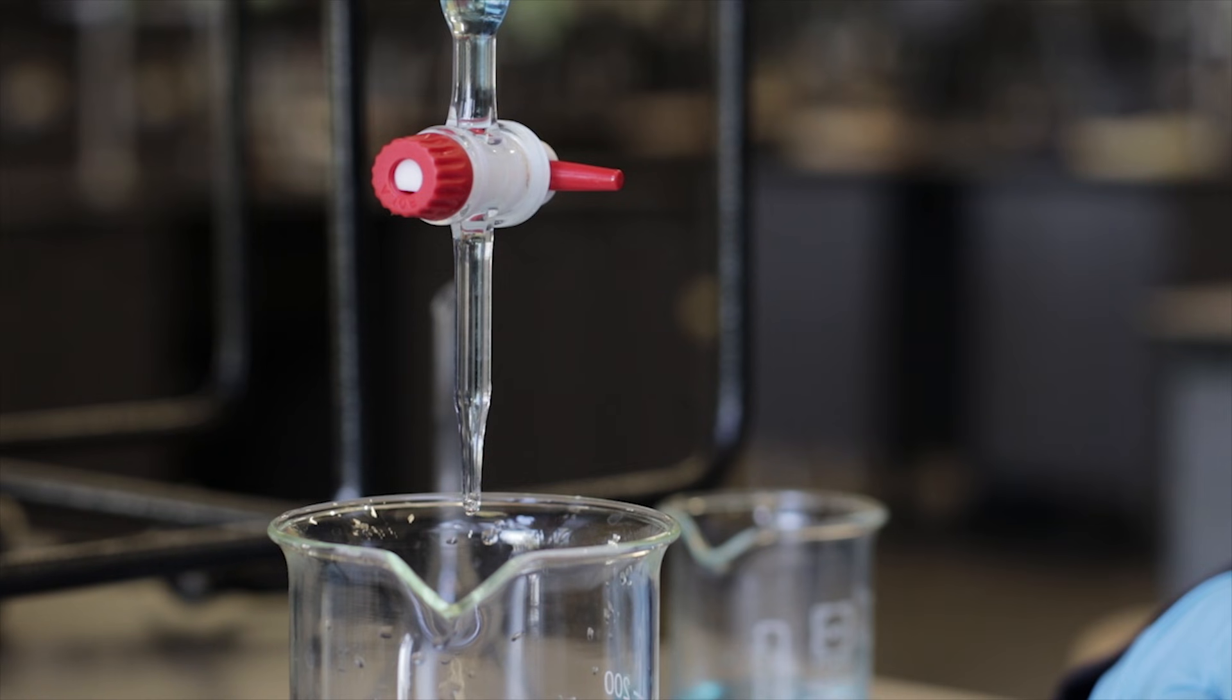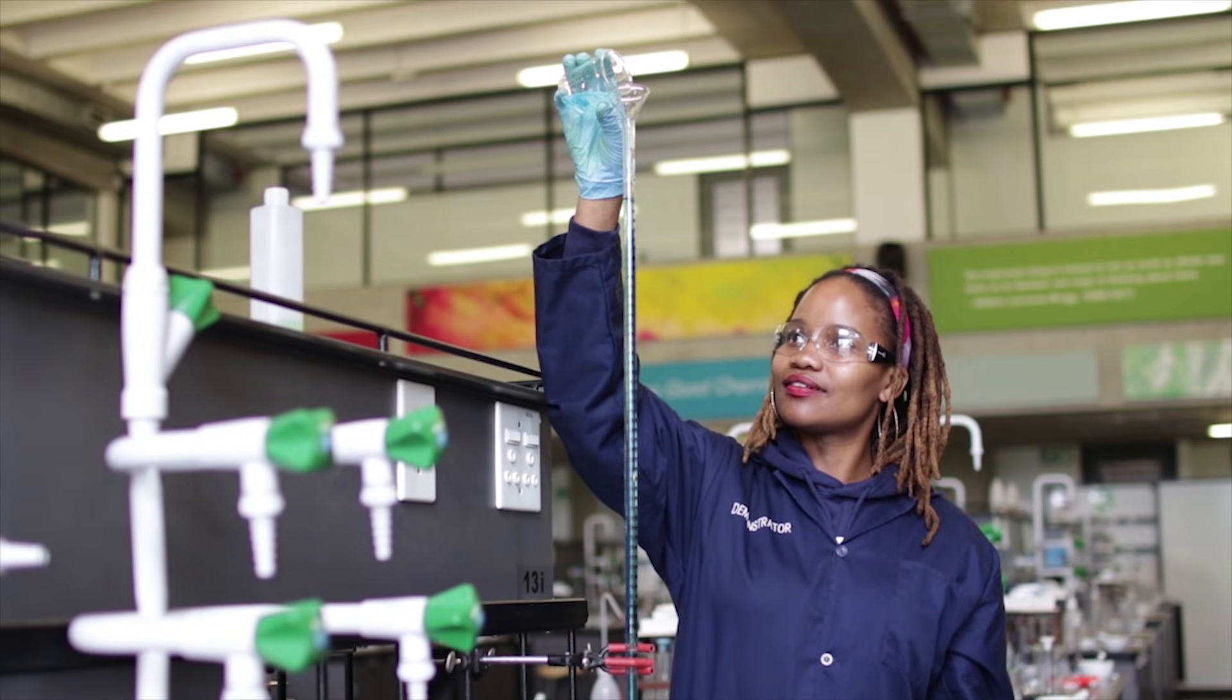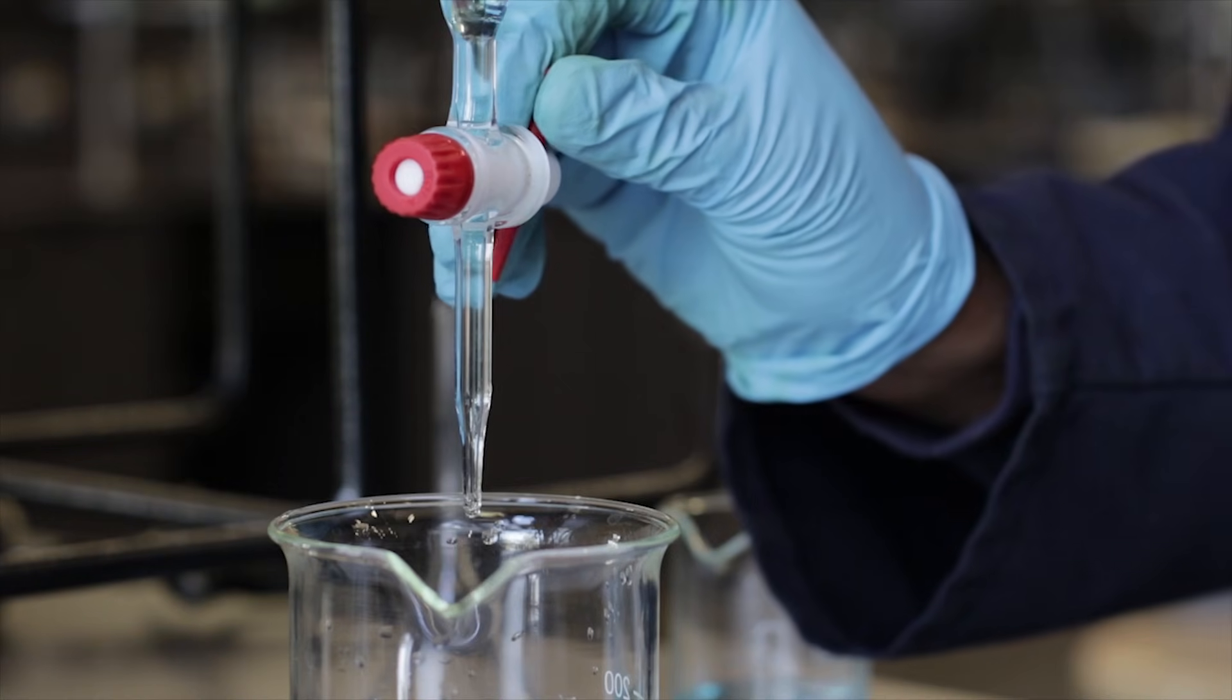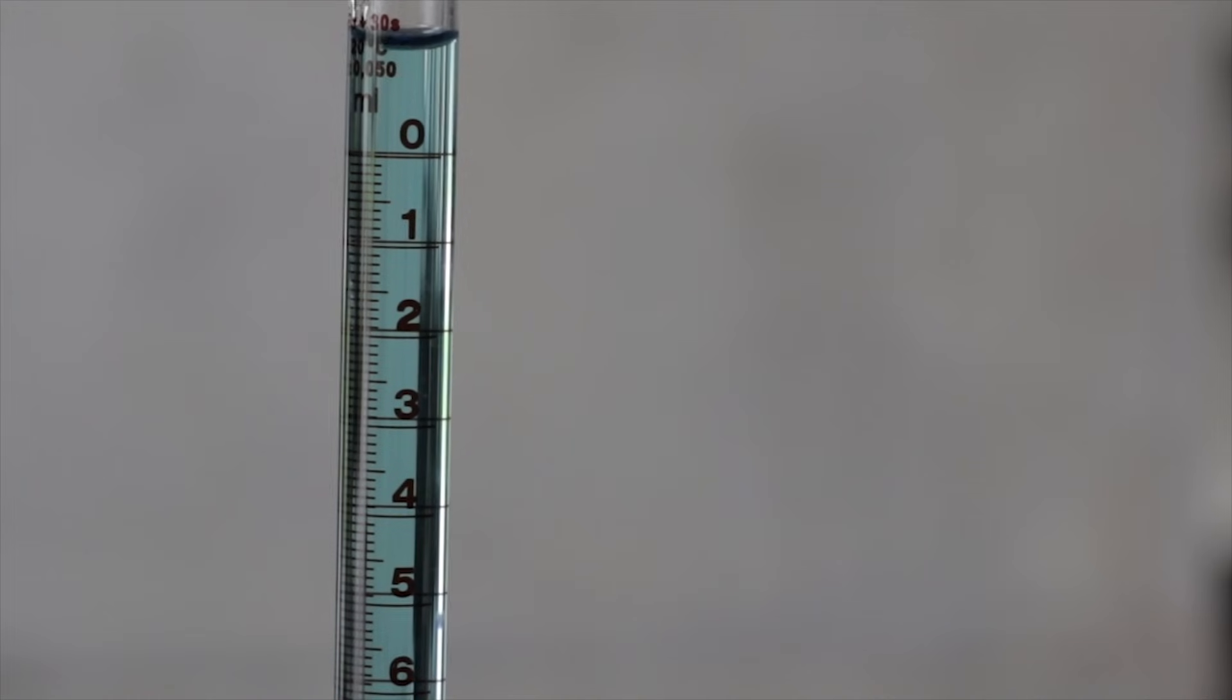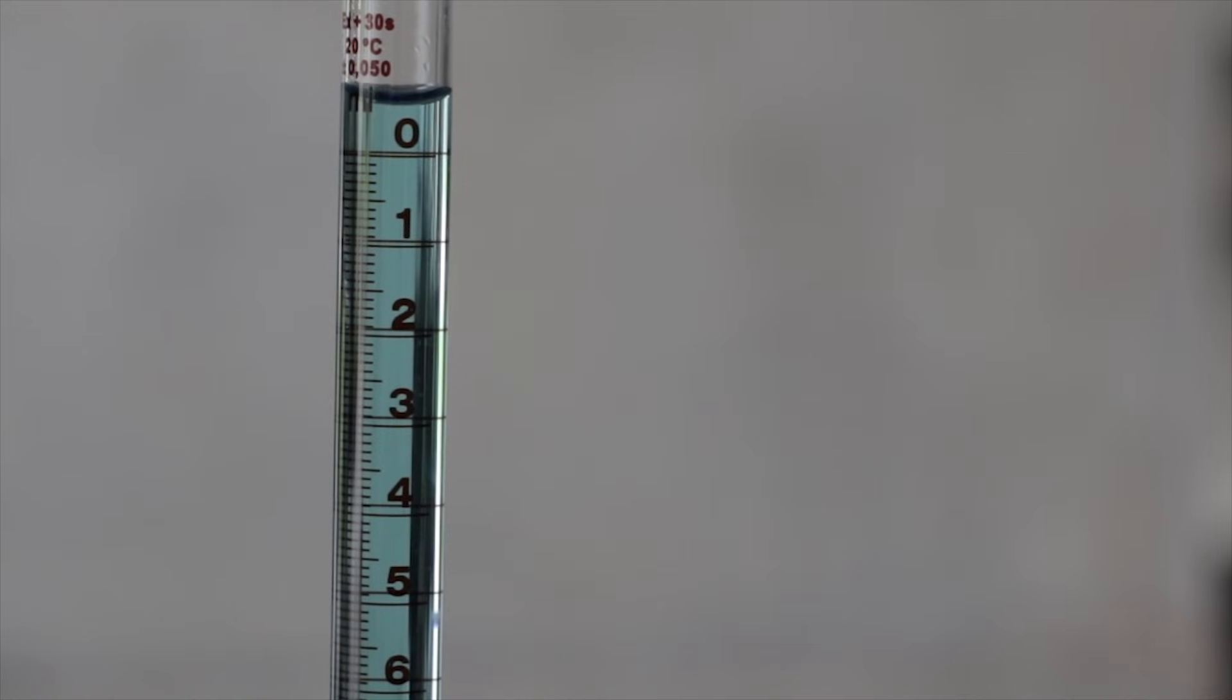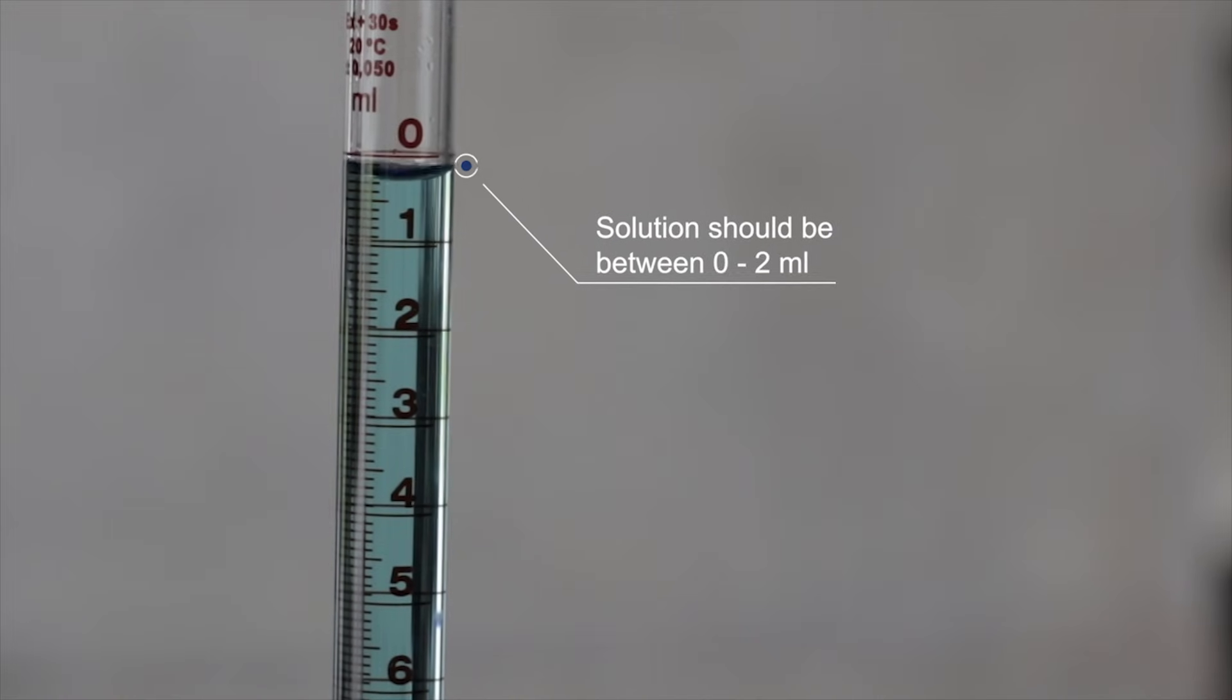Once the air bubbles have been removed the burette is refilled with the solution using the procedure mentioned before. At this point the burette tap is open to let the solution run out until the lowest part of the meniscus is level with any graduation mark of the burette between 0 and 2 milliliters.